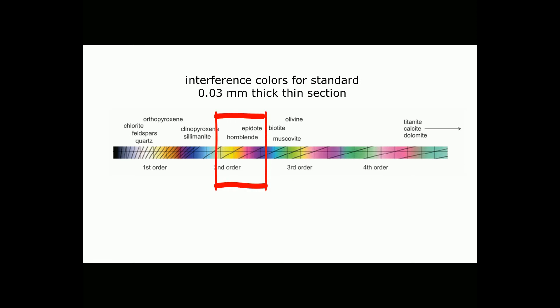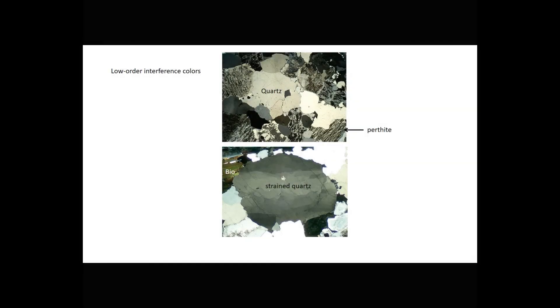So we might say that hornblende has middle to upper second-order colors, and not worry about whether it was pink or orange or yellow. Typical minerals that display low-order interference colors include quartz and the feldspars. In these two views, we see large grains of quartz. In the top view, we can see perthite, which is a potassium feldspar.